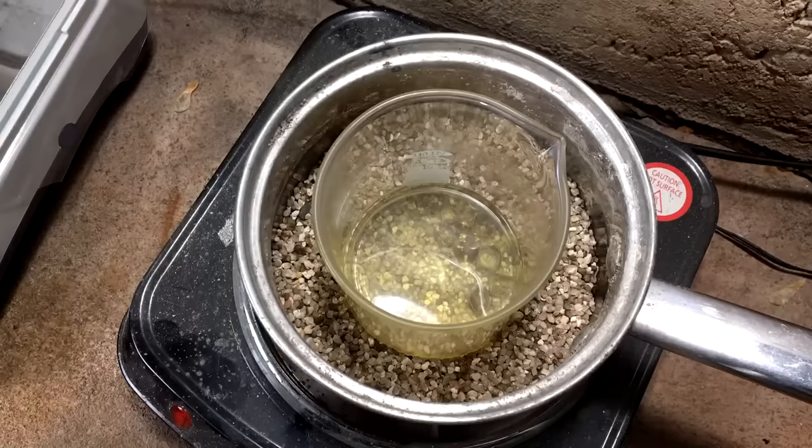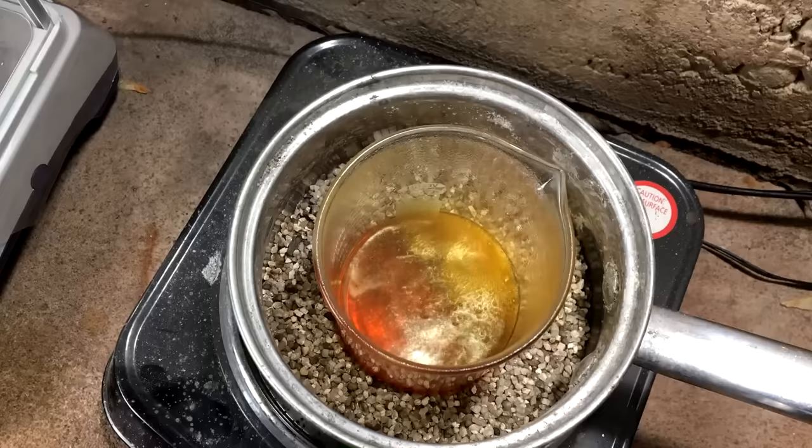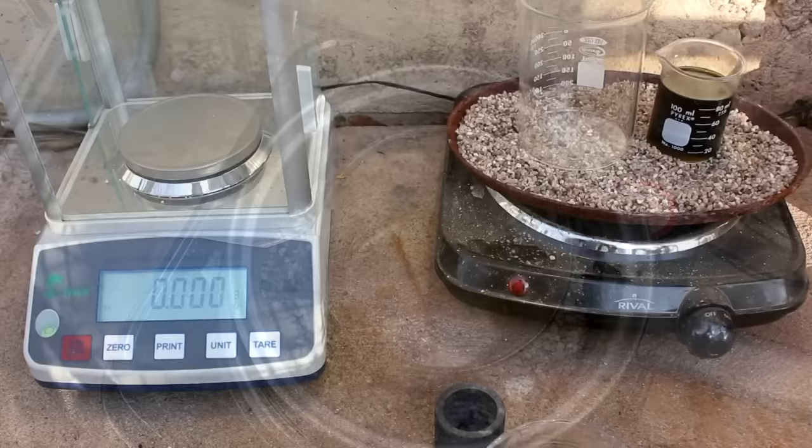In this gold dissolving process, the nitric acid oxidizes a thin layer of gold. The hydrochloric acid is then able to react with that oxidized layer, forming chloroauric acid, which is water-soluble. Once the hydrochloric acid strips off the oxide layer, the nitric acid is free to oxidize the gold once again, and the process continues until the pieces are completely dissolved.